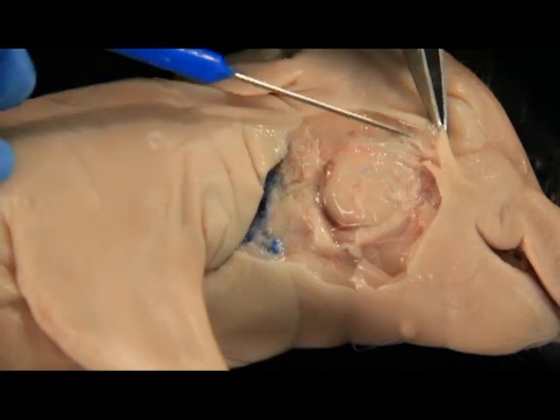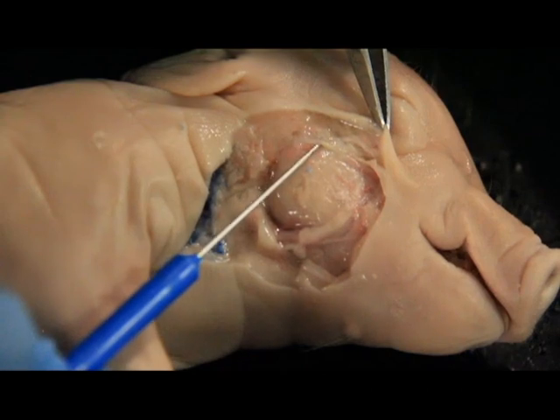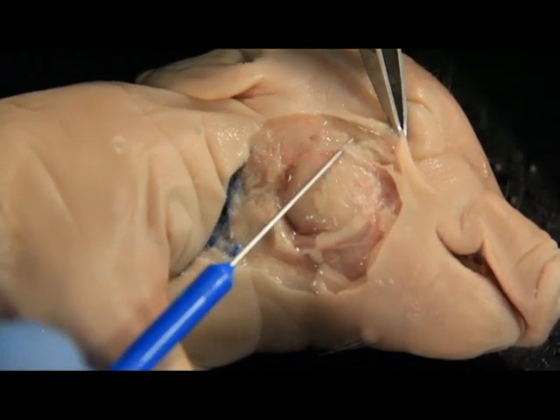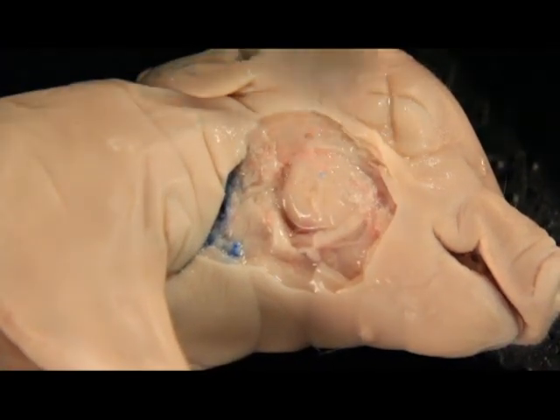And again, that controls your facial features. So you don't want to cut that away. And again, a lot of people do, and that's okay. You do have another cheek if you want to try again. But this tiny little white line, again, going across the top of the masseter muscle, that is your facial nerve.